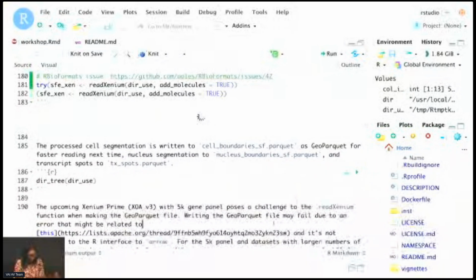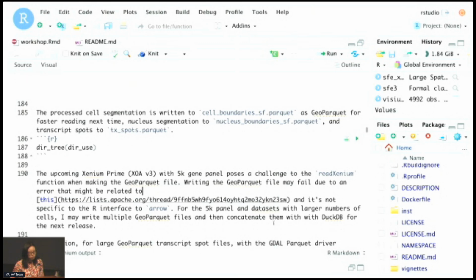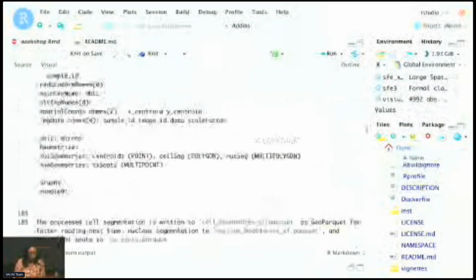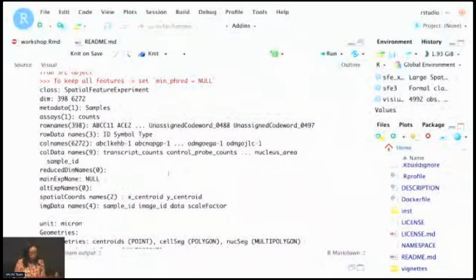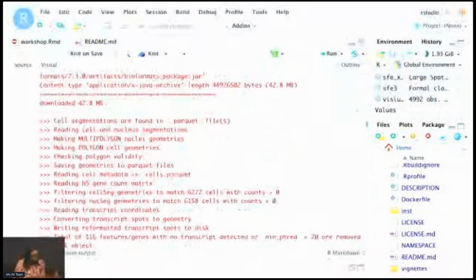While it's installing, basically BioFormats is a Java library that can read a lot of different microscopy file formats. So OME-TIFF, which Xenium uses, but also some commercial proprietary formats like CZI, ND2 and so on. Also Zarr. Okay, so here it's running.